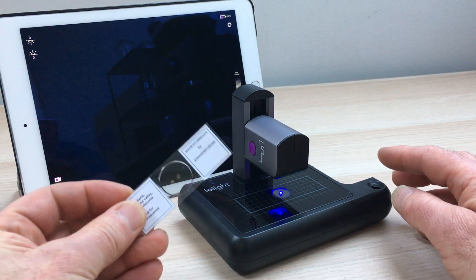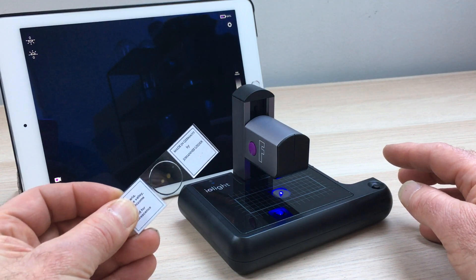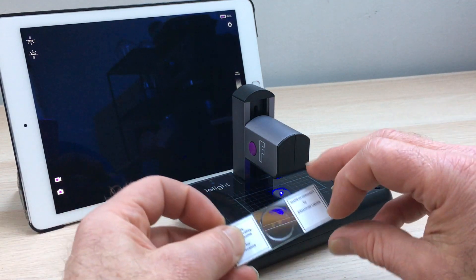The sample we're going to look at today is a cross-section of a plant stem, and it's been stained with three different fluorescence dyes.